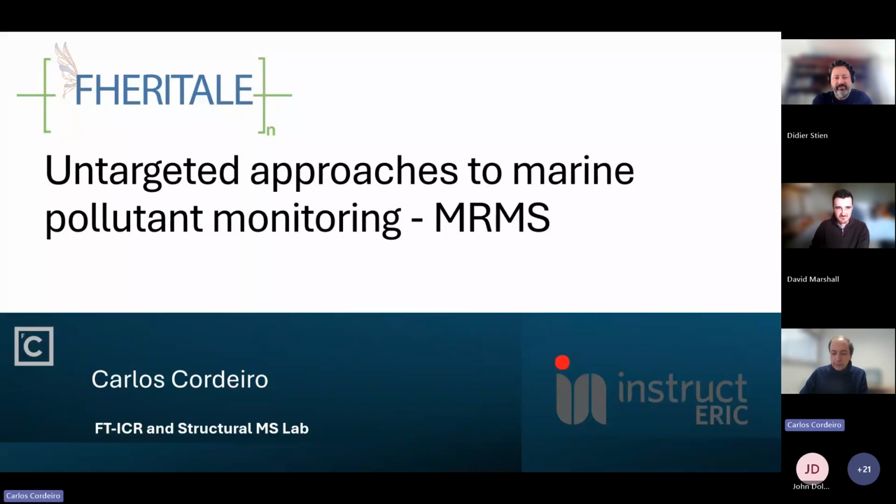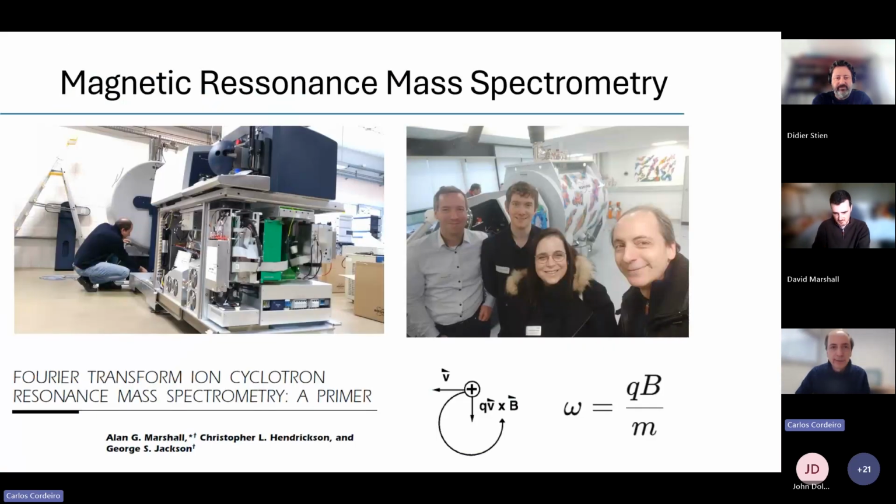So indeed, I do work with a very specialized type of mass spectrometer that was formerly known as Fourier transform ion cyclotron resonance mass spectrometer. Currently it's known as magnetic resonance mass spectrometer. So basically this looks like an NMR that has been tilted over, and physically it's actually very similar to an NMR because it works from the time domain to the frequency domain. So it's basically a trap, a magnetic trap. And the ion dynamics is determined by the Lorentz force.